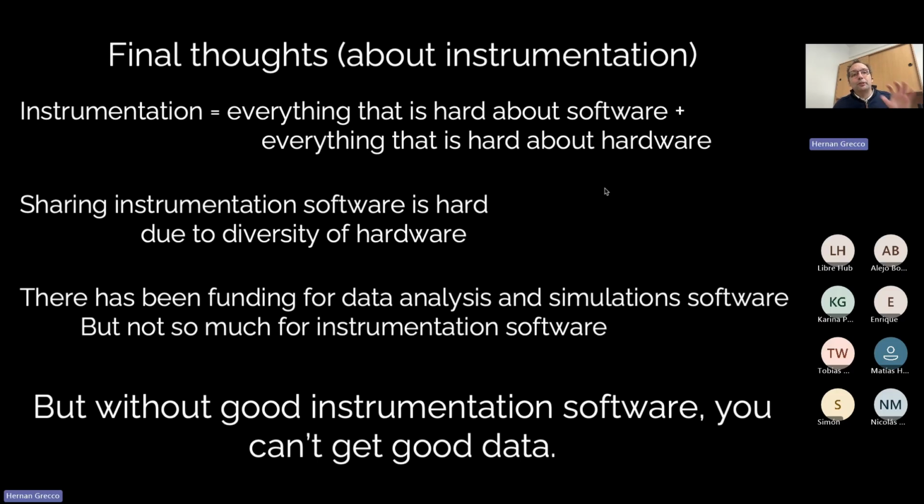And I think we need to do more, because instruments are the way in which we acquire data, and we need to keep that to the highest standard possible. Having reproducible outcomes requires having reproducible protocols, and we can do that through good software.